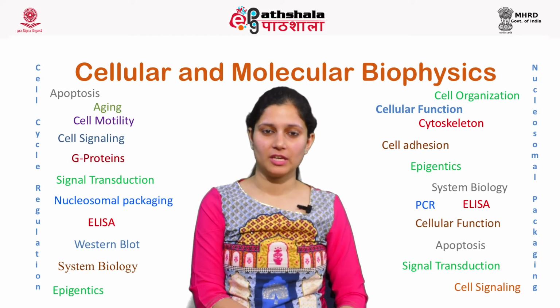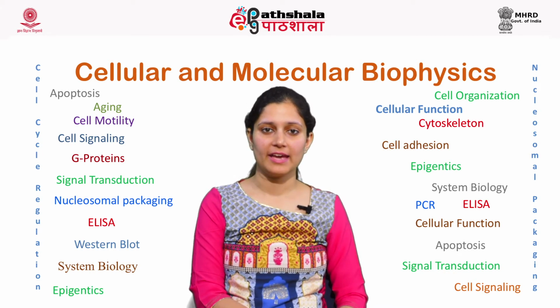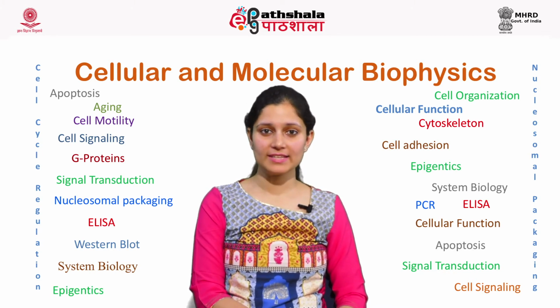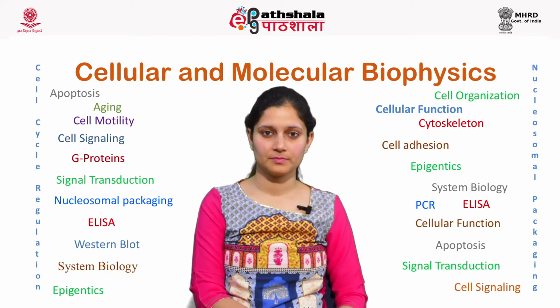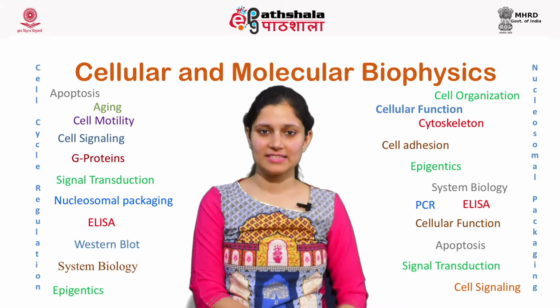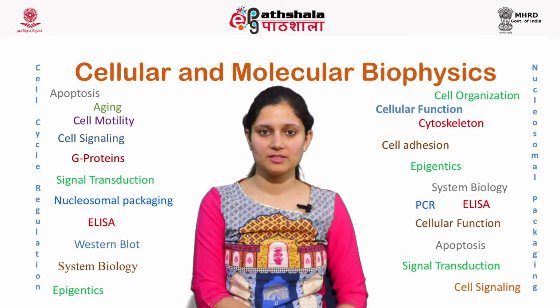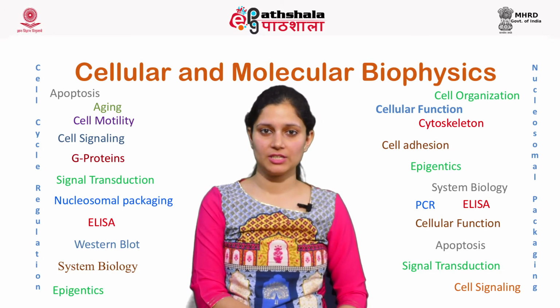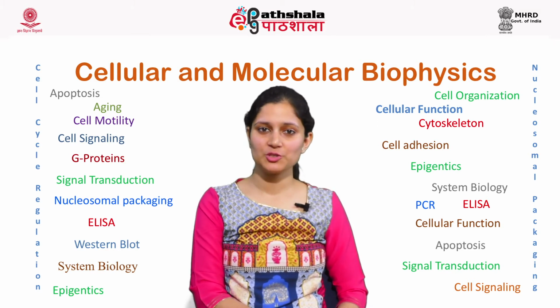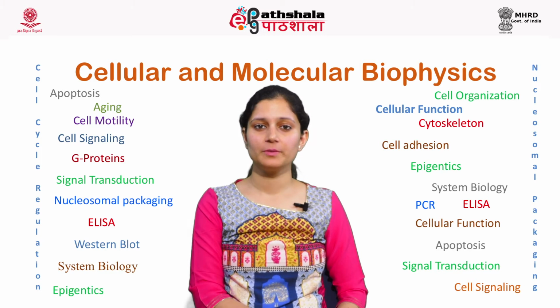After the PCR amplification has taken place, we have to check whether the desired PCR product has been formed or not. There are 3 steps that have to be taken care of. The first is to check whether the product is formed or not. The second step is to check whether the product is of the right size or not. The third important step is to see if there is specific amplification. All these things can be achieved by running the PCR product on gel electrophoresis. In order to make sure that our PCR is successful, we should do a gel electrophoresis of the PCR product.